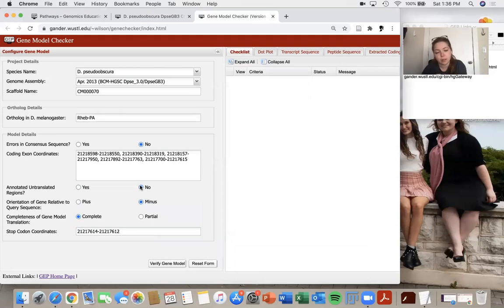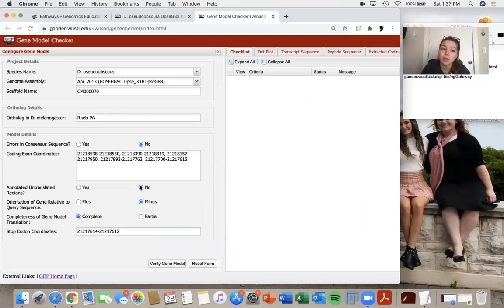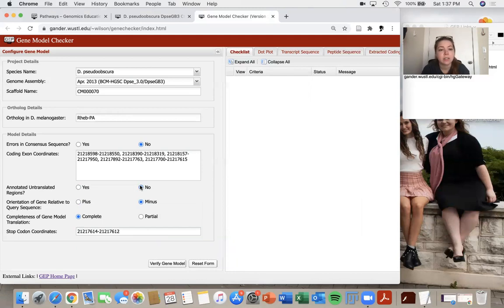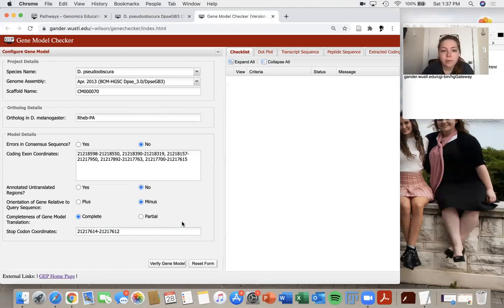For the completeness of these genes, we are again going to assume that these are complete. And if you have any inklings that your gene model may not be complete, that would be another situation where we would ask you to contact the TA so that we can go through that a little bit more with you. So it looks like I have all of my information filled out. And the next step is to verify the gene model.